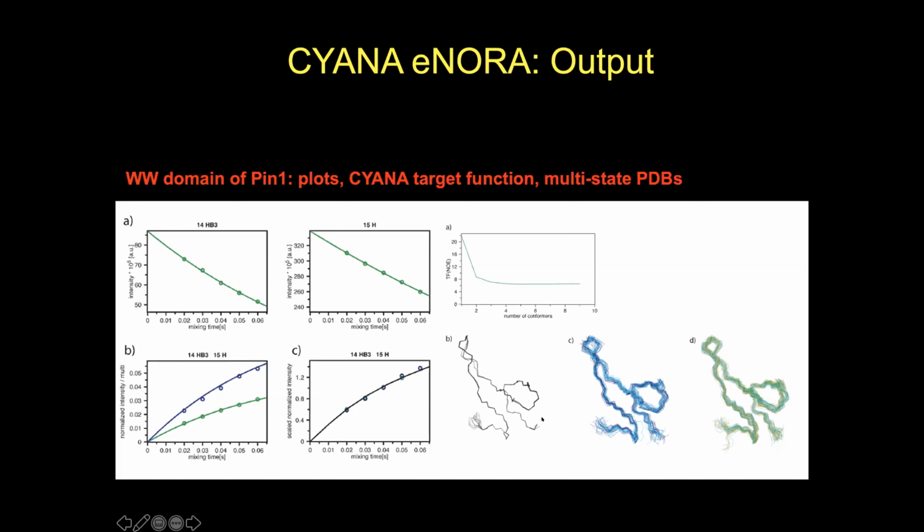That's because this is the WW domain again that I have shown before with an enormous number of NOEs. Then you can run it with 2 states shown here. And you see that the sorting program was able to identify similar states.